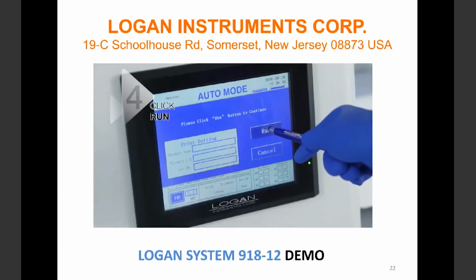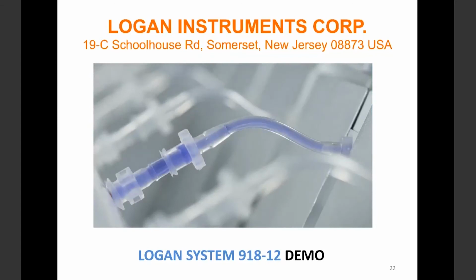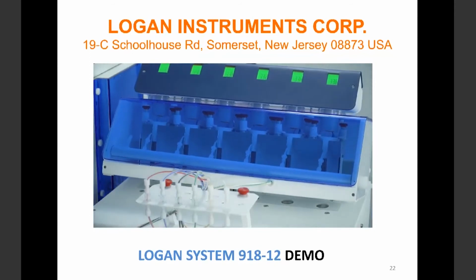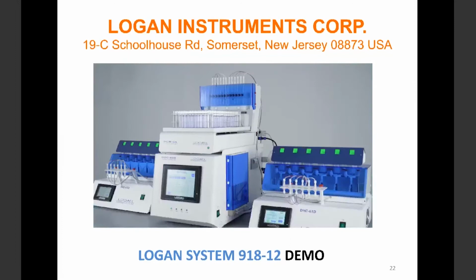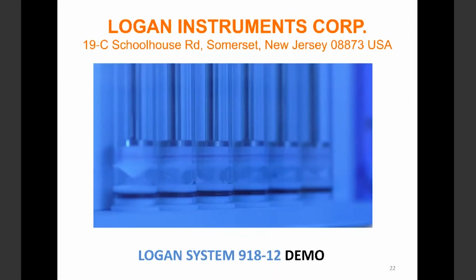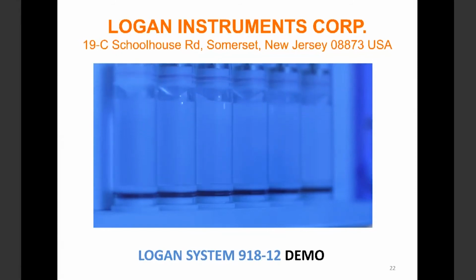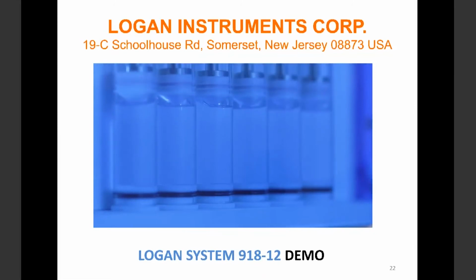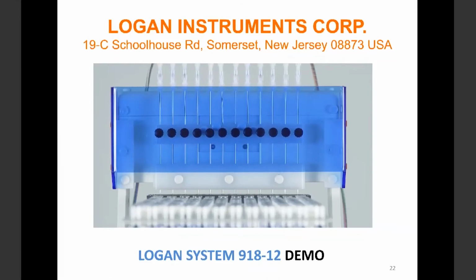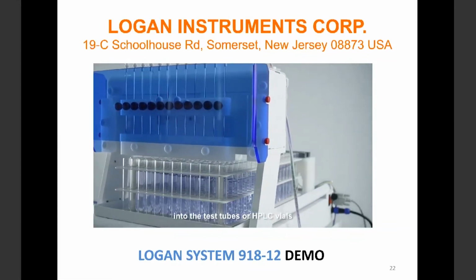Step 4. Click Run. Step 5. Sampling. The sampling probes move to waste. Priming starts. The priming is to get rid of the dead volume in the line. Then we take a full stroke of the sample in the cell and deposit it to waste to clean the line, then deposit into the tube. Sampling probes move to the designated row to pump the samples into the test tubes or HPLC vials.